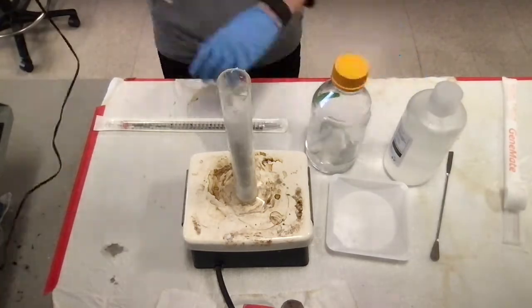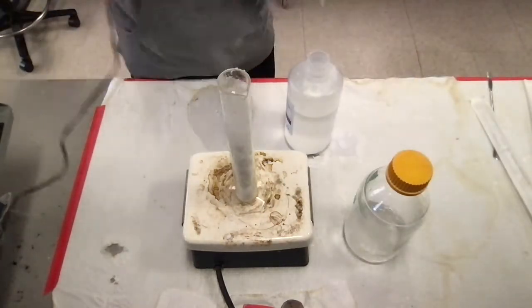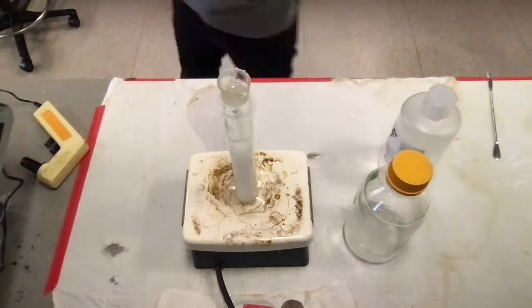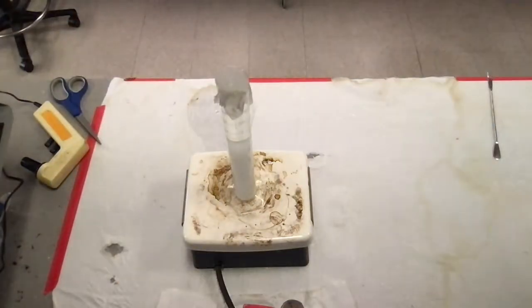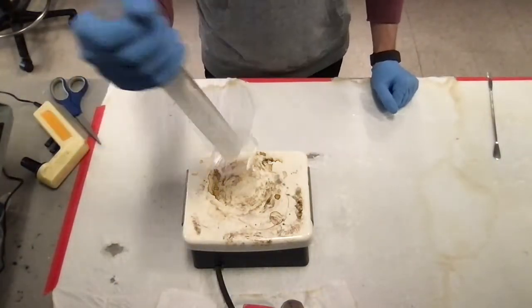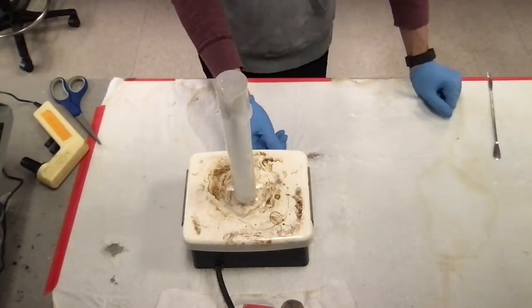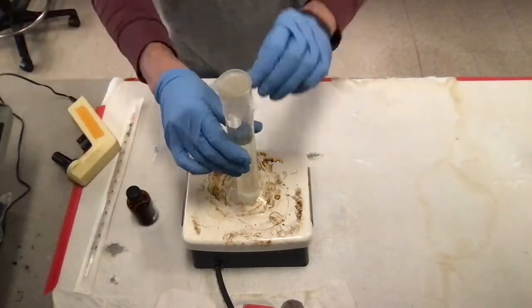We're going to go ahead and mix this together, and I always put the urea in first because it needs to dissolve. So we'll go ahead and do that. I tend to put a cap on top of this and then shake it up and down so that it goes into solution. Sometimes I also grab it in my hands to warm it up a little bit. And then after we get that done, we're going to add formamide to it.